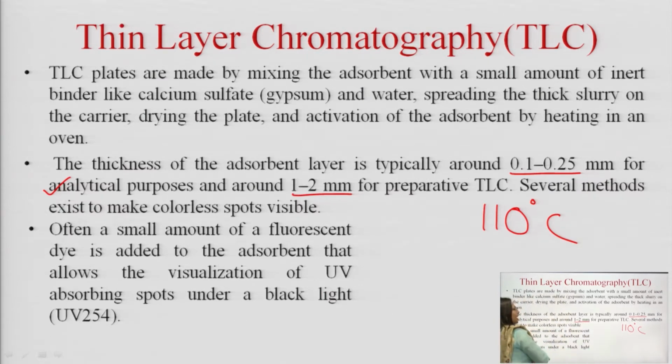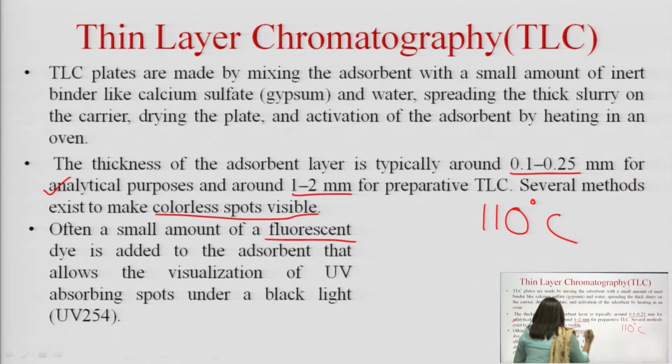Okay. So, there are various methods which make the colorless spots of the TLC visible. Often a small amount of fluorescent dye is added to the adsorbent.